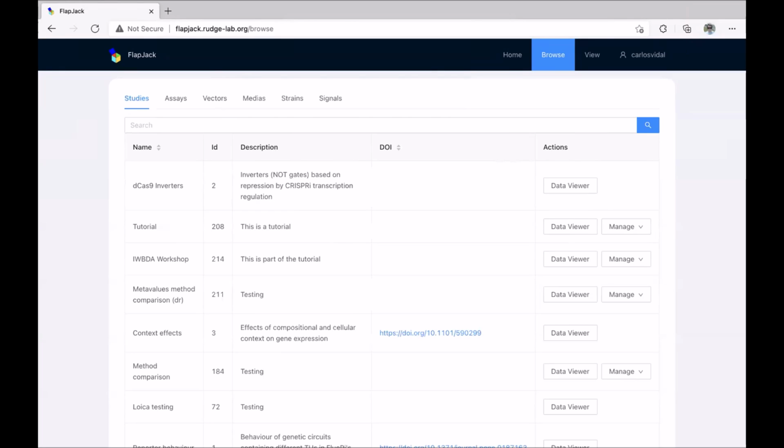So I have, I guess, a suggestion and a question. Within Flapjack itself, if you were able to create a work list or a sample sheet, which is input to the plate reader, I think that may be helpful. It would tell the software, which is going to write out the result file, which sample goes in which well, being able to map between this software and what it expects to read in afterwards would help that.